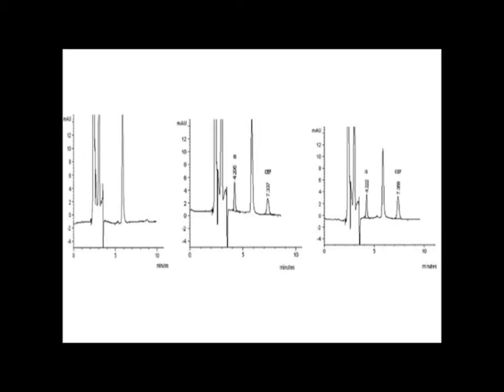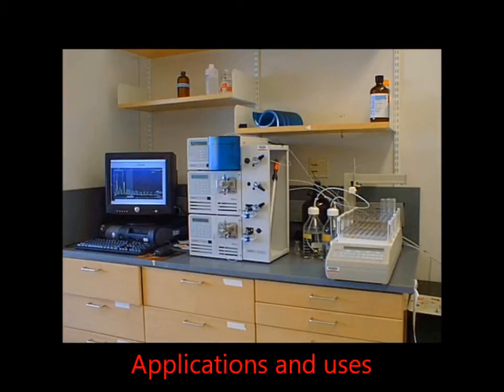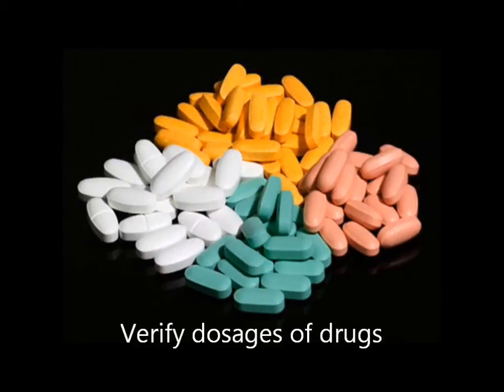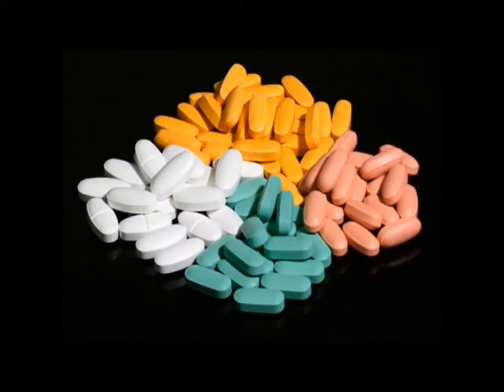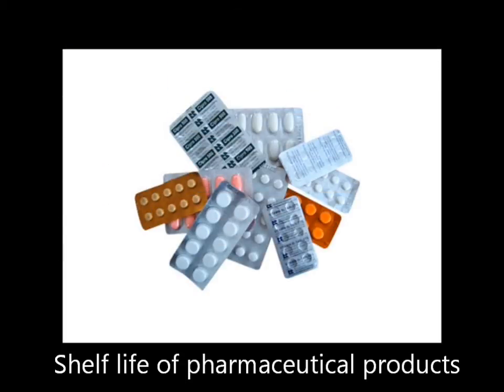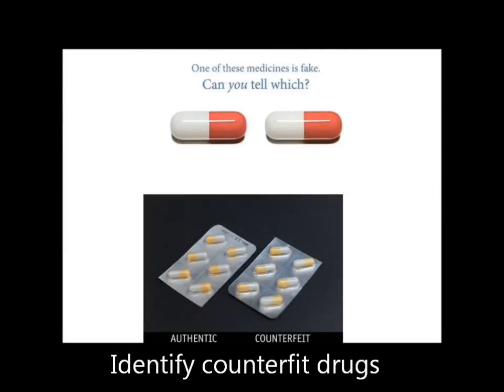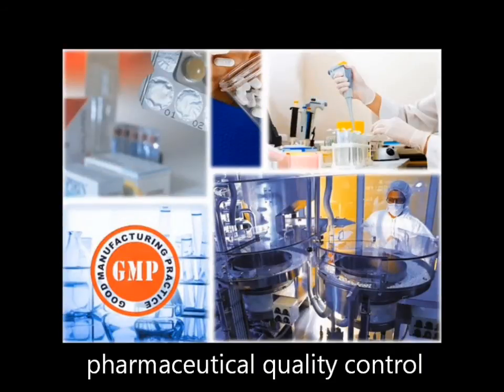HPLC is one of the most widely applied analytical separation techniques. It has the ability to separate, identify, and quantitate the compounds that are present in any sample that can be dissolved in liquid. Today, compounds in trace concentrations as low as parts per trillion may be identified. It is the most important analytical tool in many fields and industries. In the pharmaceutical industry, it is used to verify drug dosages, to determine shelf life of pharmaceutical products, to identify counterfeit drug products, and for pharmaceutical quality control.